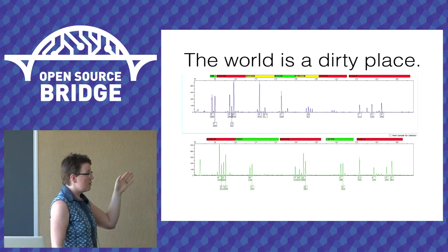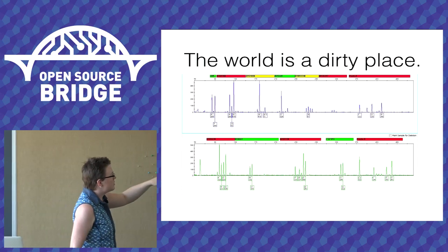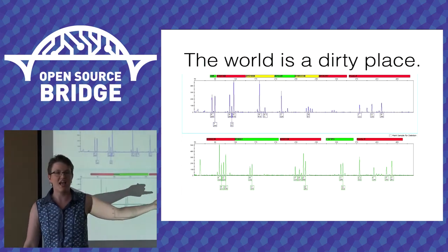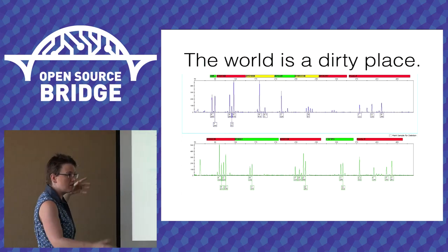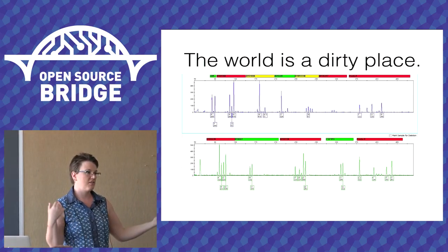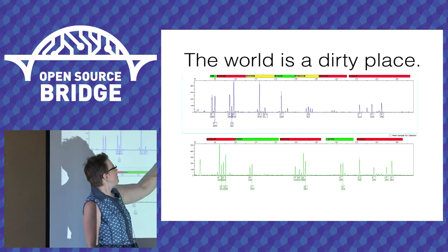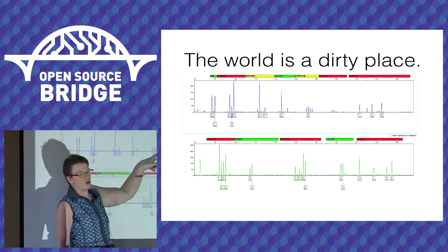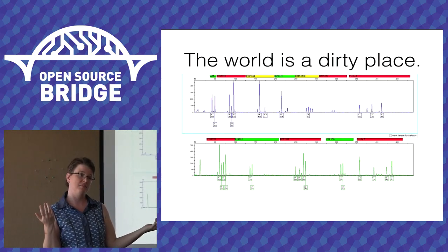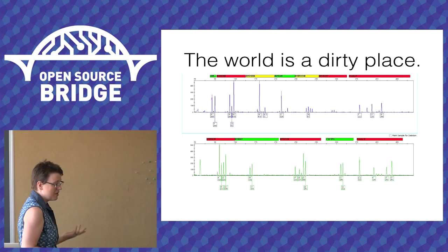This is the same mixture. Actually, it's a different mixture. I take it back. This is a mixture of at least two people, but at this part, there's no numbers here whatsoever. I didn't get any DNA at all at that section of the DNA profile. It was broken down DNA. I didn't get it, or there weren't enough cells there to get the profile. We call that dropout. Look at this little bit of DNA. There totally looks like there are 4 peaks there, but you're only seeing one number because only one peak is above my threshold. So the other 3 dropped out. I've got no data. I can't use that because it's not above my threshold.